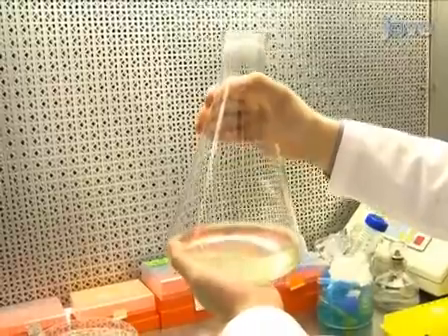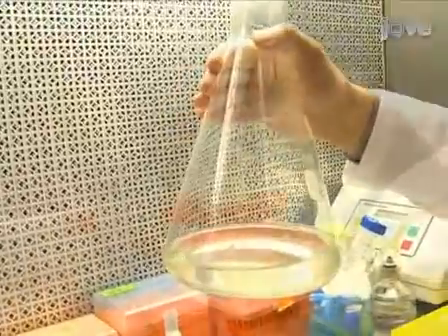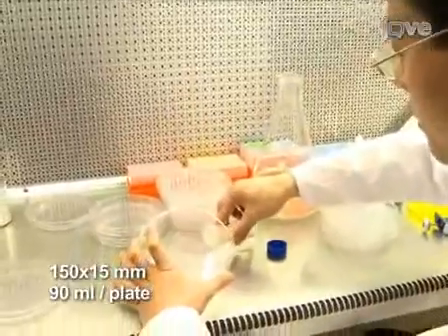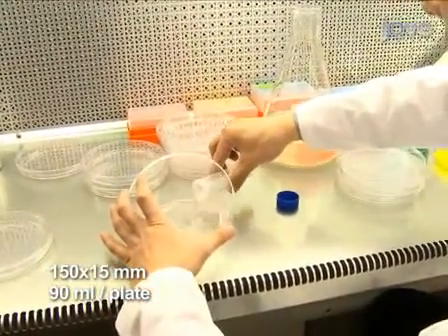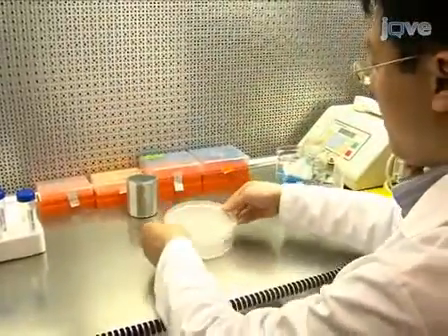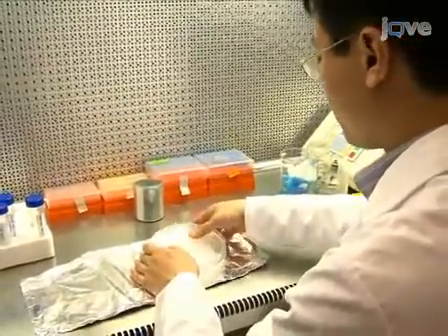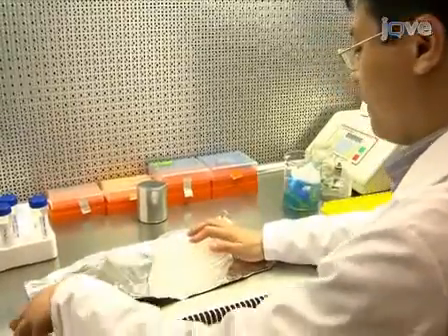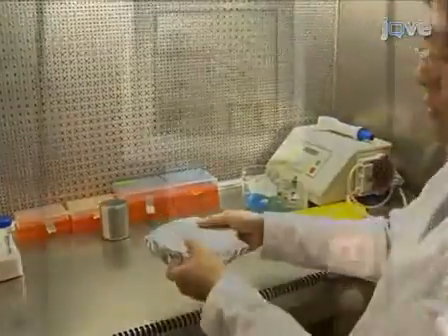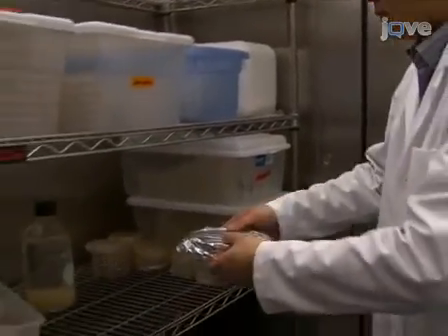If one is able to keep one's hands on the bottle for 10 seconds, then the medium has cooled down sufficiently and the plates can be poured. Move to the hood in order to pour the medium into 150 by 15 millimeter petri dishes, 90 milliliters per plate. Store the plates at 4 degrees Celsius.